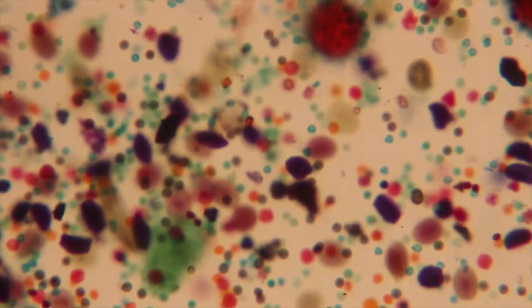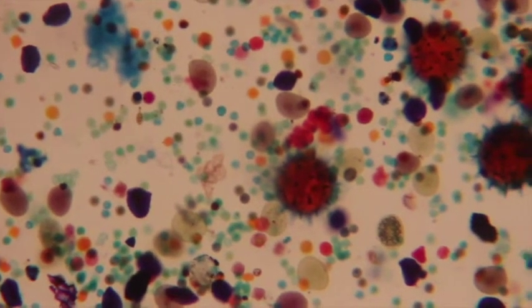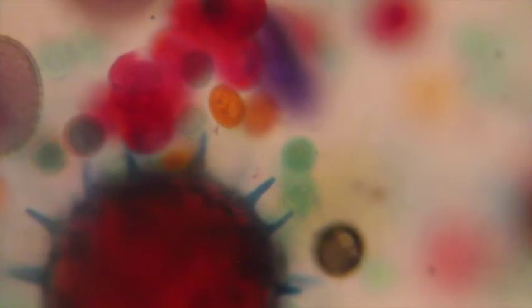So just amazing, all the diversity there. We'll flip up to the 100x magnification. You just kind of focus in and out here. It's just really amazing how diverse pollen is. Right, so these are the male gametophytes, all different types of male gametophytes from these flowering plants. Okay, these are haploid, right? And just all different types in here. All right, cool.